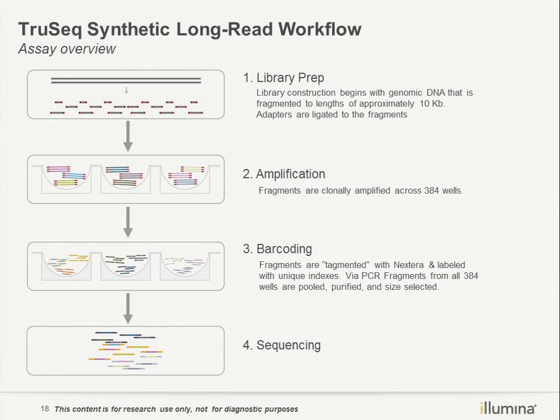And then, in the second step, we construct the whole genome from each larger sequence from different wells. So in this way, we finish the construction after 2 steps. That is why we call it synthetic long reads.